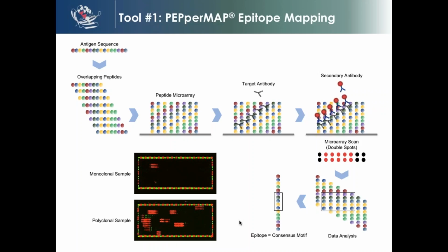Yeah, we use two different kinds of cyclization processes. So the disulfide process and the thioether method, where we print the cysteine as a first amino acid on the linker, which has a specific label, and this reacts with the N-terminus of the peptides to form the bond.